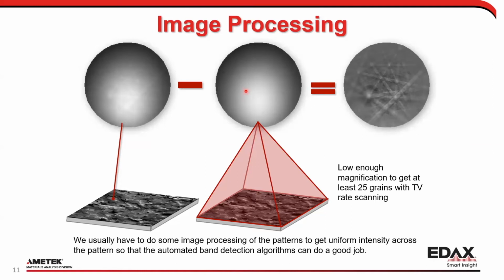Also be aware that, of course, you want to make sure it's sample. You don't want to be going into free space or onto the edge of the sample if possible, because those can actually put artifacts in the background itself.